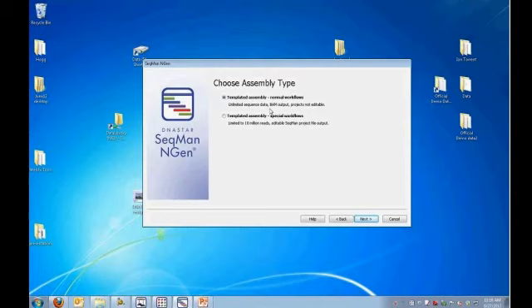It's a very efficient file format so that I can have very large data sets, billions of reads in a project, and then still open it on a laptop computer and do analysis. So the BAM file is an incredibly efficient way to view and analyze a very large data set. However, they are not editable. So that means I can't go in and make micro edits or split contigs or do that sort of work. If I need to do that, I have the SeqMan editable format, which has a limitation on project size, so it's mostly used for microbes and small eukaryotic assemblies.